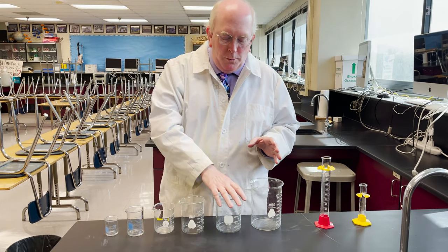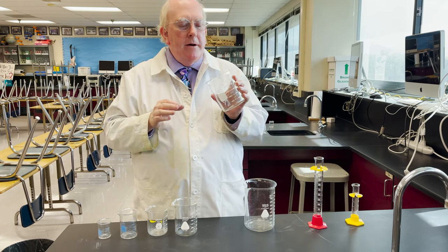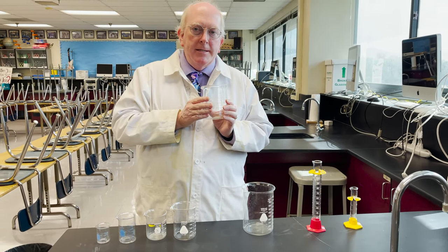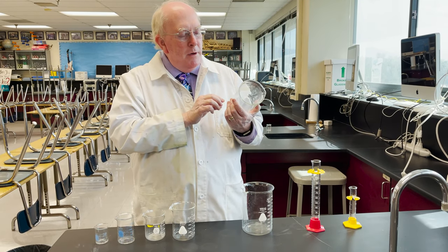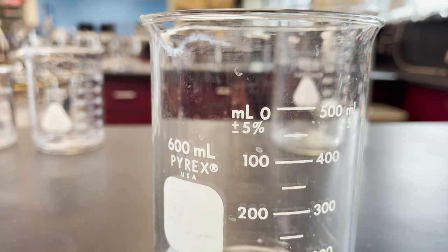Now beakers look really nice, they have all these numbers on them, but let's be honest, the job of a beaker is to hold liquids — it's not to measure. And often what you will find on beakers is this plus or minus 5%, and 5% is really big.